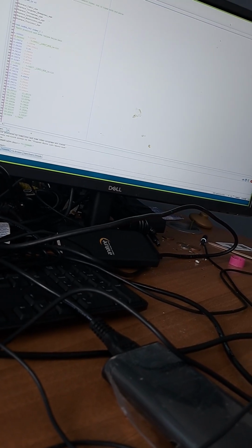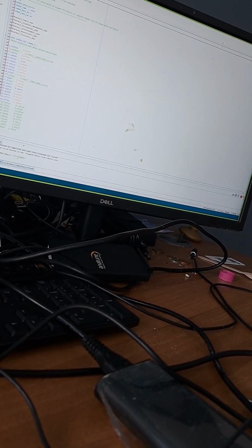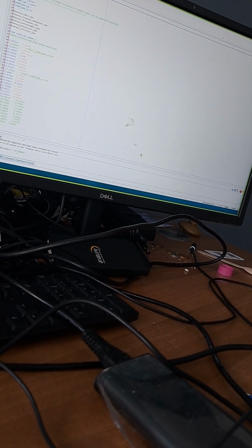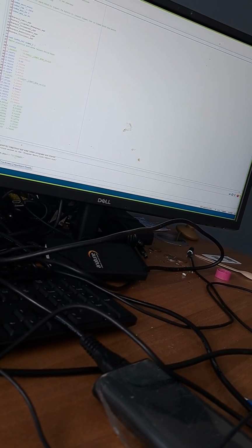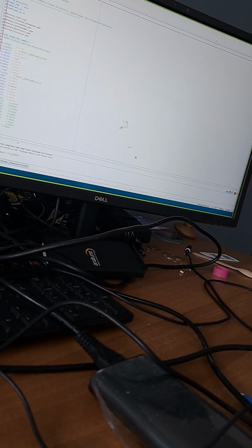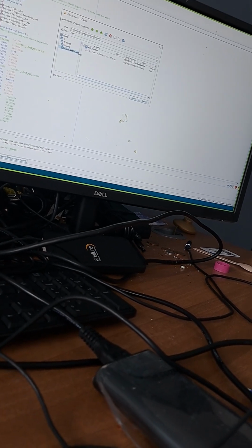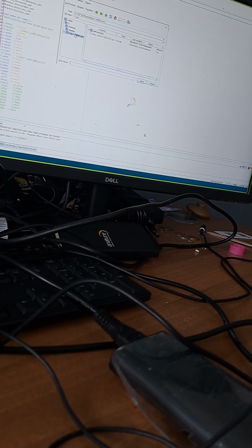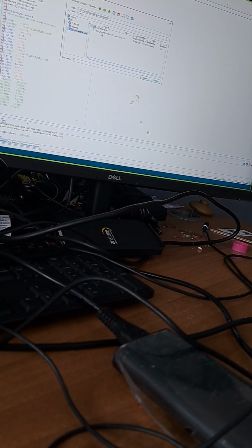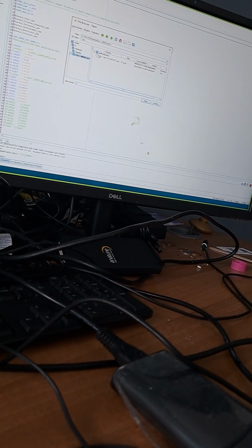Is this or shall I save it from? So there'll be a new file called whatever it is .ndx, and you want to open that. The filter on the thing says star.raw.